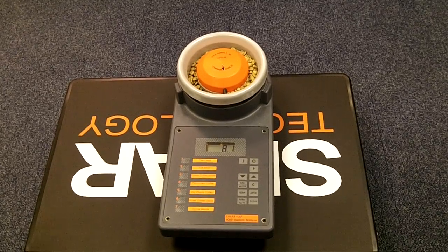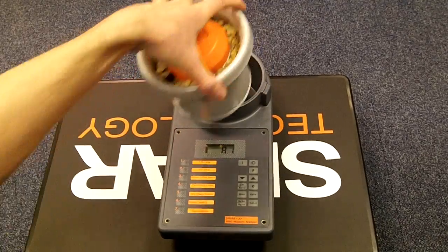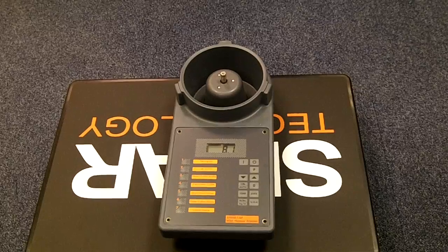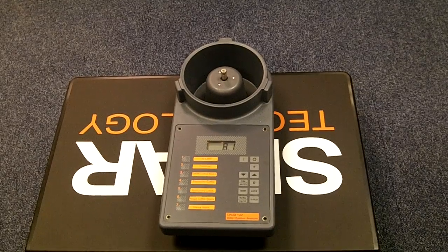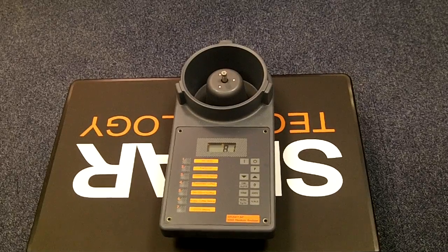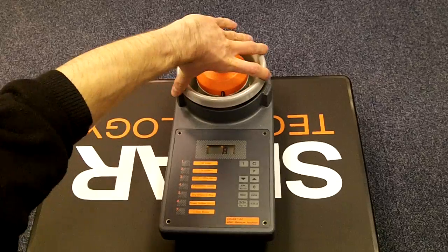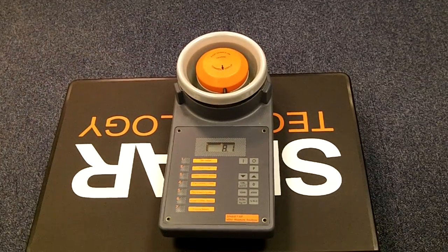To remove the sample cell just twist it gently clockwise and lift. You can then discard the sample and replace the sample cell as before, giving it a slight clockwise motion as you push down gently. You're now ready to take a new reading.